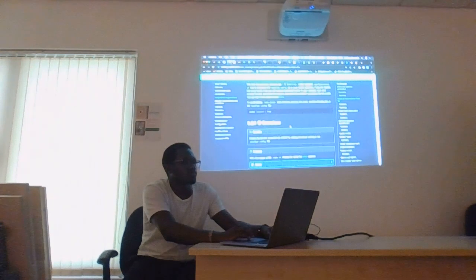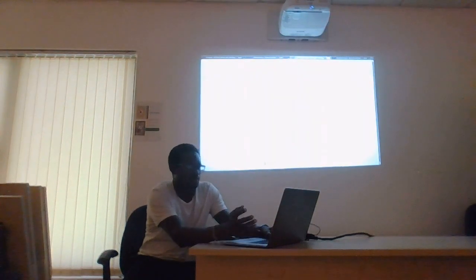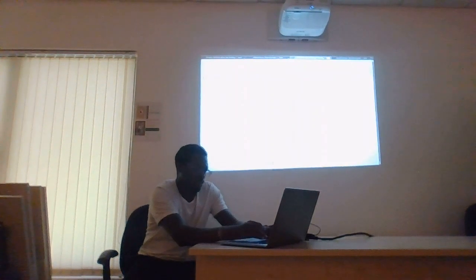Within the conda environment, I don't need to use Docker, because I know these tools are installed in my environment. I know it takes time; if I run it with Docker, it will have to pull those images.